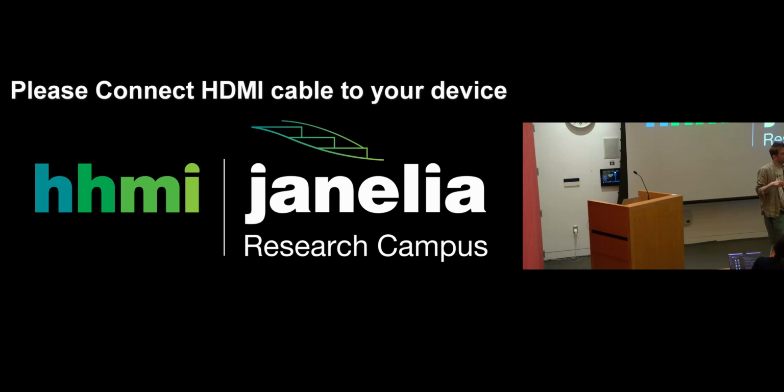So we probably want the user to be thinking about the grouping. In the tetrode case, for instance, you probably want to do some of your pre-processing on everything. If you do a common median on one tetrode, it just wipes out the signal. So it's all a bit subtle, and it's worth thinking about from the user. So we probably want them to think about it.